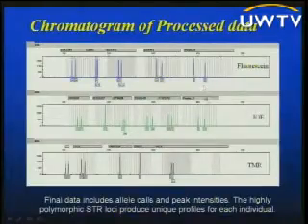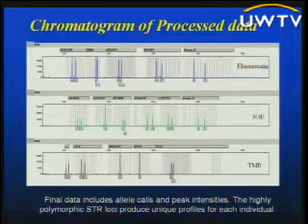So this is what a typical profile would look like for an individual. This is a chromatogram of processed data. This is a multiplex reaction. All 16 sets of PCR primers are within a single tube. You add your chromosomal DNA, you set up your PCR reaction.